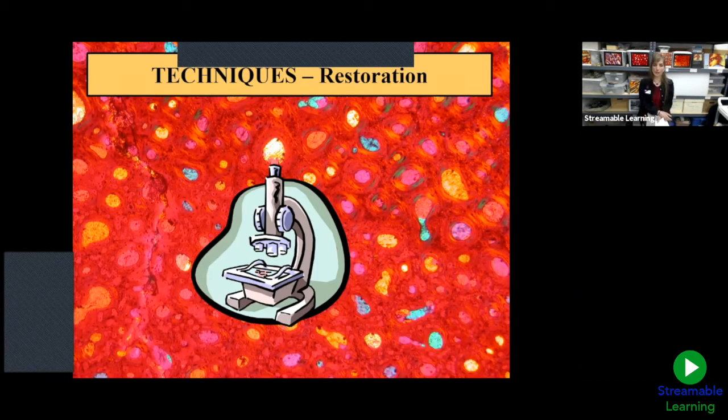Why was there water on that saw? Oh, good question. So there's water and there's actually a little cooling fluid in the water as well. So that helps cool the saw and lubricate the cut. Great question. Excellent. Yeah, the plastic would melt and the metal would start to bend. So that keeps everything at the best temperature for that really, really rapid revolutions of that saw and quick cutting of the specimen.